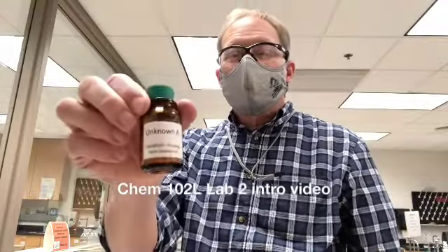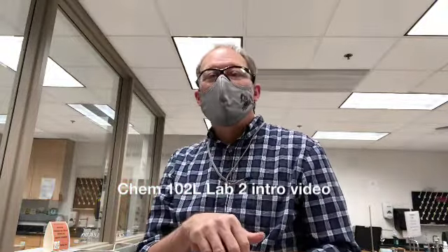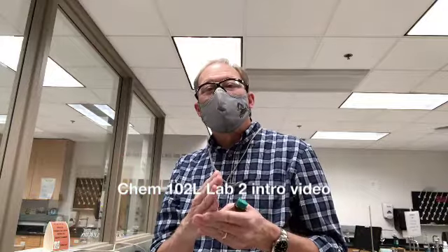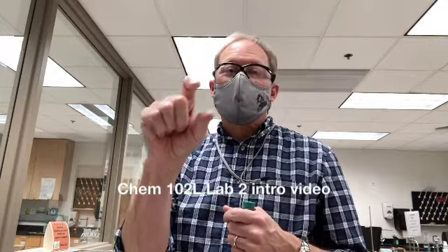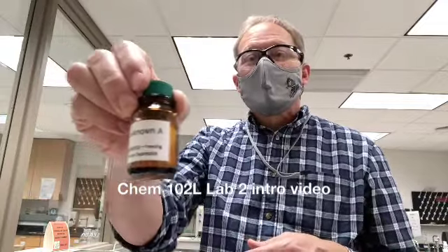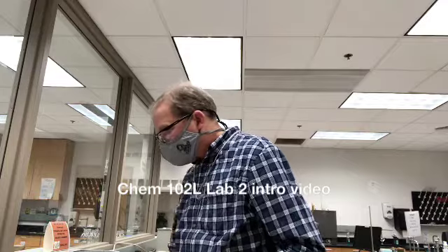So once you add a known amount of this mass into the pure sample, you'll have created a mixture. You'll know the mass of it, but the change in the freezing point will allow you to figure out what the concentration is. And with that together, you can find the molar mass of this unknown compound. So that's your challenge, is try to identify this compound.